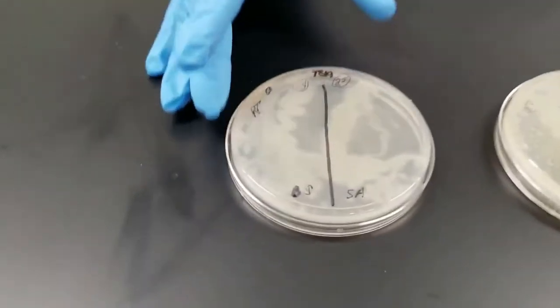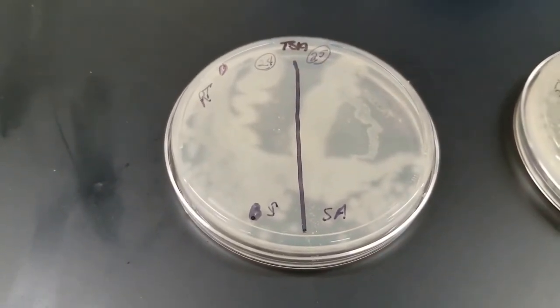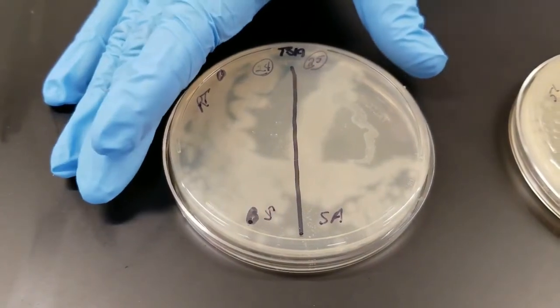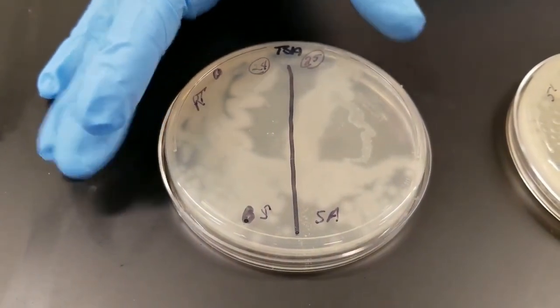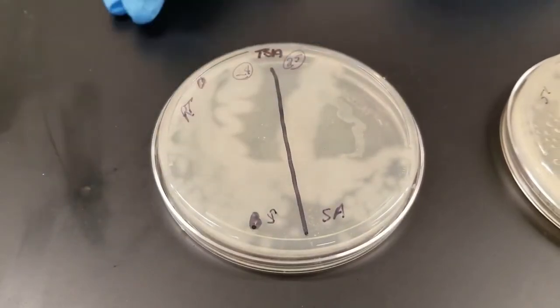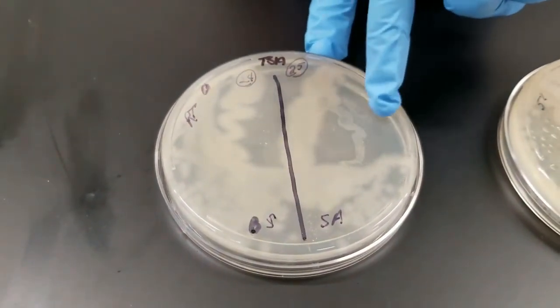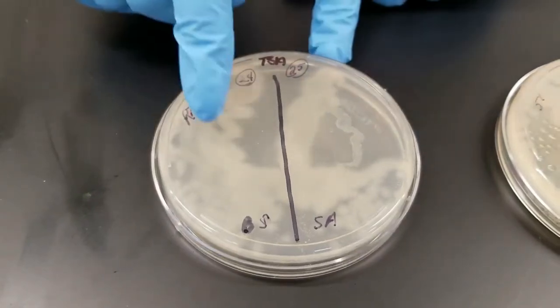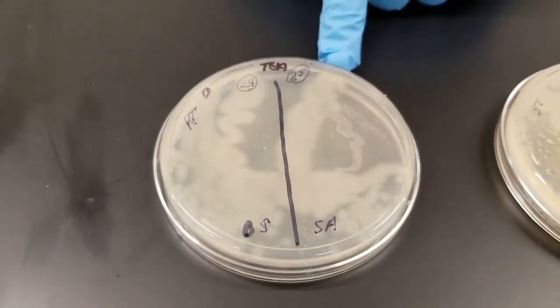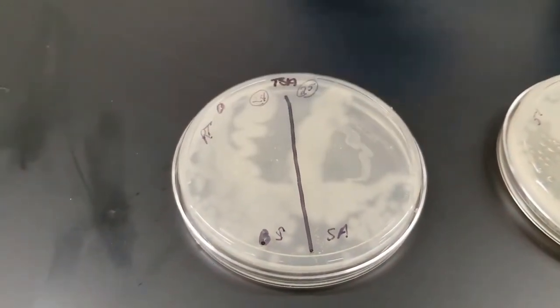If we start over here, this plate, we worked with both Bacillus subtilis and Staphylococcus aureus. And so at room temperature and no exposure to UV light, we inoculated this plate. So you had very good growth of the Bacillus subtilis. There is some growth of the Staphylococcus aureus right in this area. We had some competition, and Bacillus is out competing the Staph aureus at this point on this plate. But we did have growth of both.